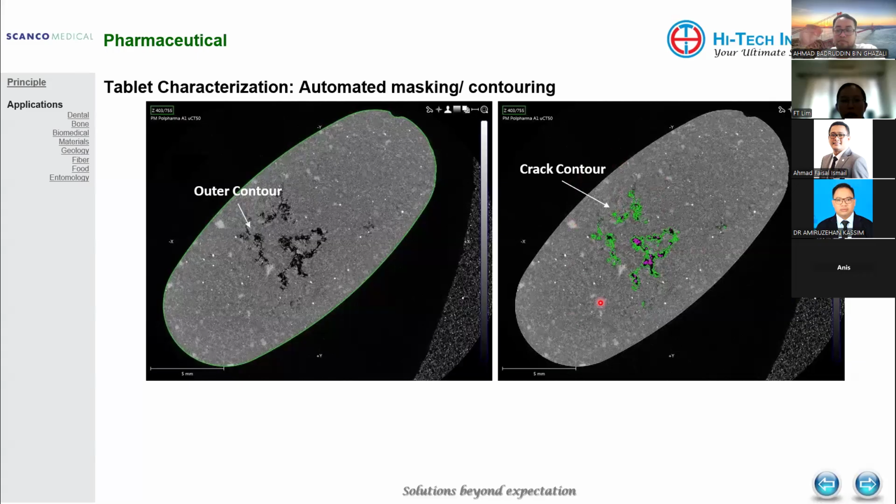And by using the software, the slices, you can easily identify the area with the crack here. At the same time, you will see there is different density. So basically, you get one intensity. This is another, very bright spots, and this is gray, and this is another intensity, different levels of intensity.